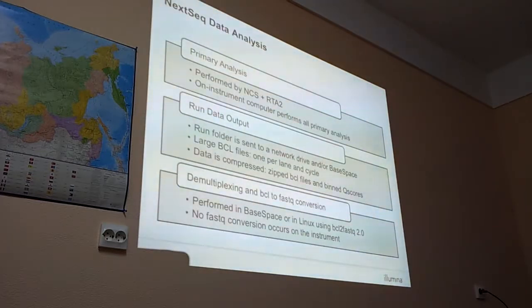No, it depends what you want to do, but actually with BaseSpace you can get the same. Of course, maybe each software has some advantages and some disadvantages. So maybe for some things Bio is better. For other things, in BaseSpace you have many different software packages. It's not only one, it's a platform.